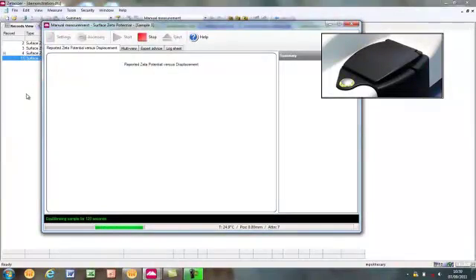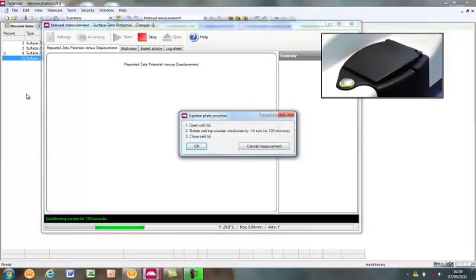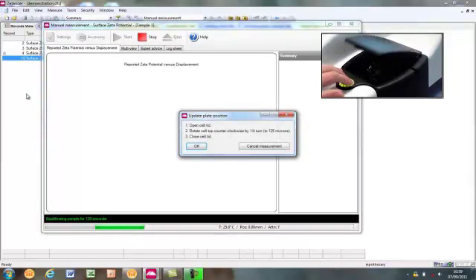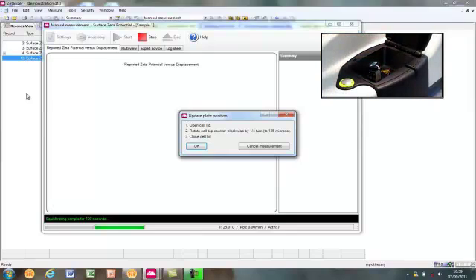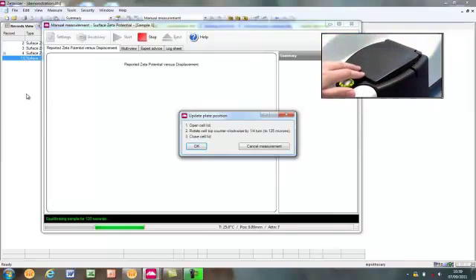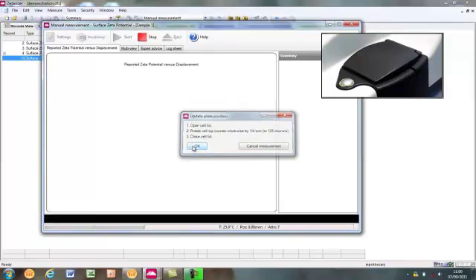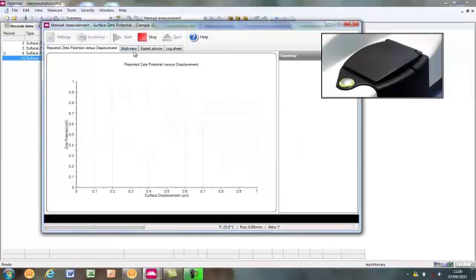At the end of the equilibration time, when the measurement proceeds, the software will show a message asking the user to move the sample position. This is done by following the on-screen instructions. Open the lid, turn the cell cap by the required amount and close the lid. Click OK to start the next step of the measurement.